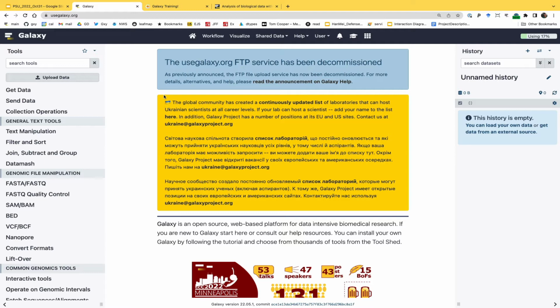So most of the genome analysis, as you know, is just changing one file format into another. For example, even if you're doing genome assembly, you can argue that you sequence, you generate files of one type, then you assemble these reads. Well, it's essentially a file of a different type. And then you annotate that genome, that's a file of a different type. And then you always do this file manipulation. Well, in the case of genome assembly, at least you get a sequence. So that's sort of one singular thing, if you're lucky, if your coverage is high enough.